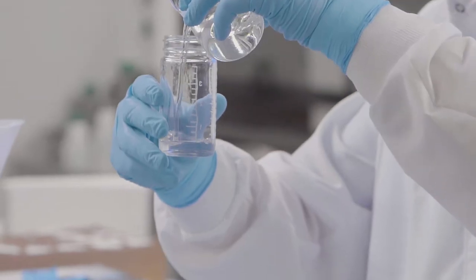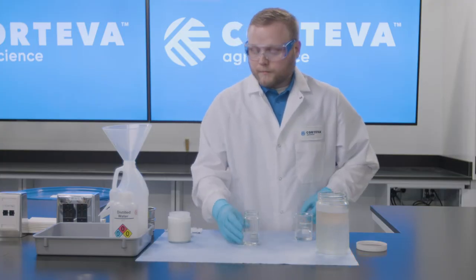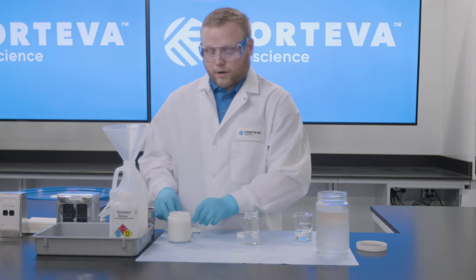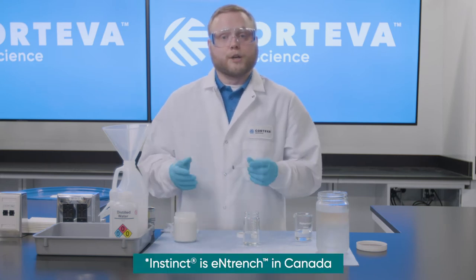So to this jar I'm going to add 50 milliliters of the UAN 32, and following standard jar testing protocol I'm going to then add our chilled Instinct new formulation product.